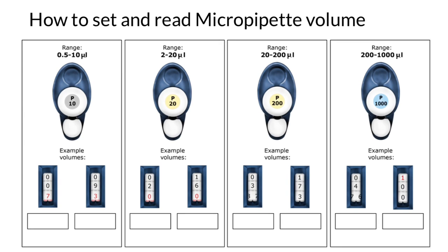Hello, and welcome to Nikolai's genetics lessons. In this video, I'm going to explain how to set and read micropipette volume. What we are going to do today is read all these numbers. And if you would be able to read them, you also would be able to set them.